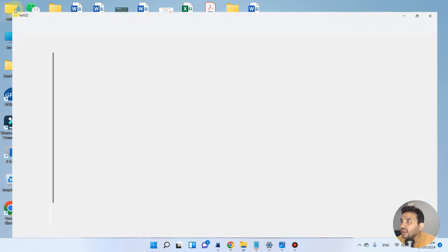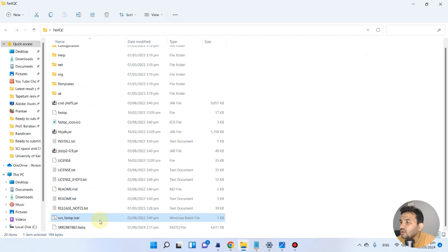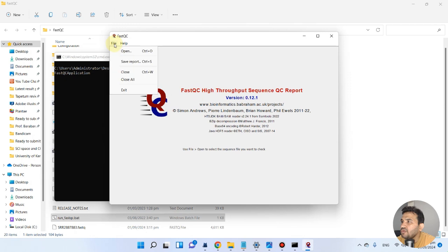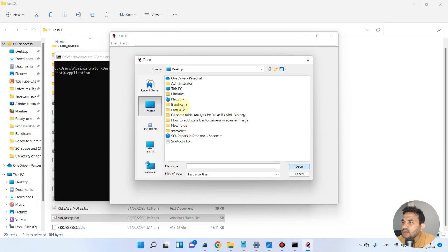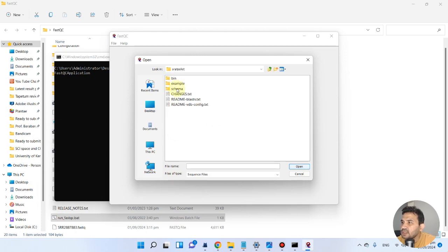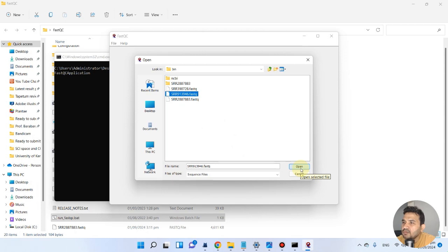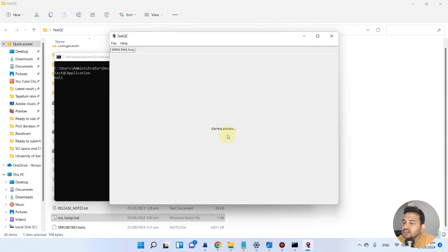We will go back to File > Open, navigate to desktop, then SRA toolkit, then bin, and select the second file — SRR913946. We open this file and the analysis is starting. This file is a bit larger so it may take a few seconds, possibly up to a minute, so we have to wait.